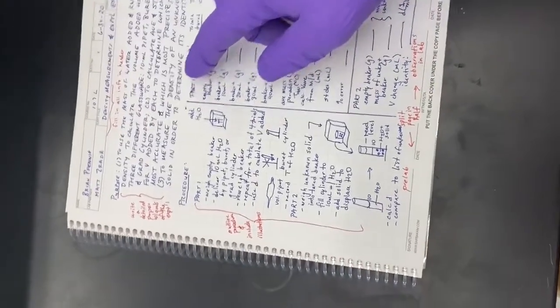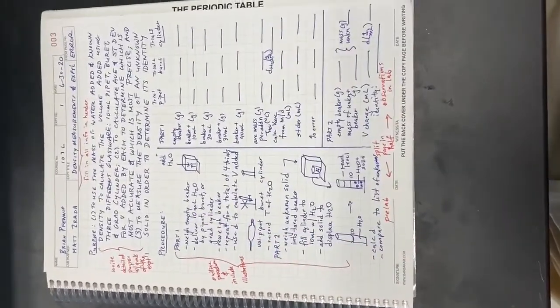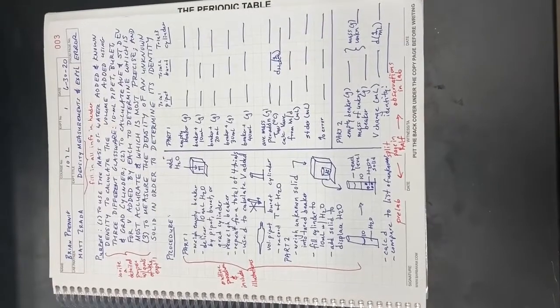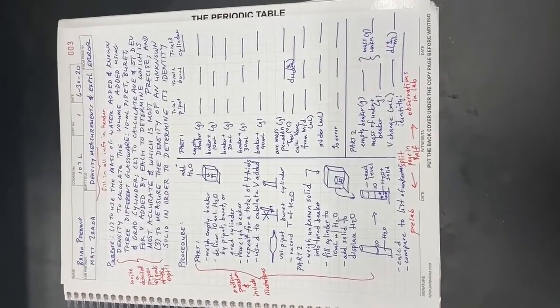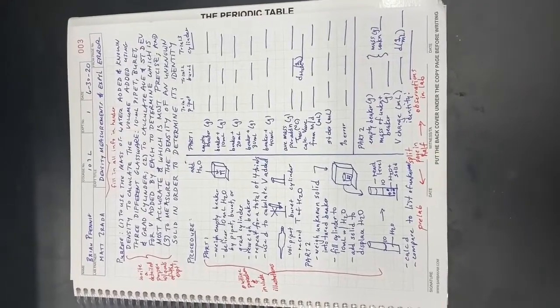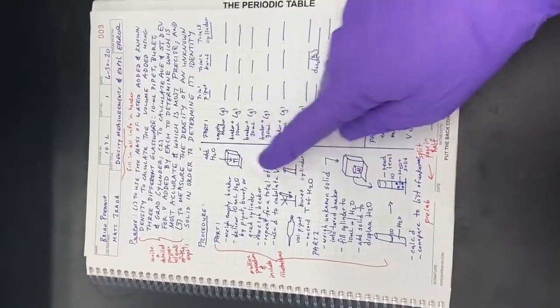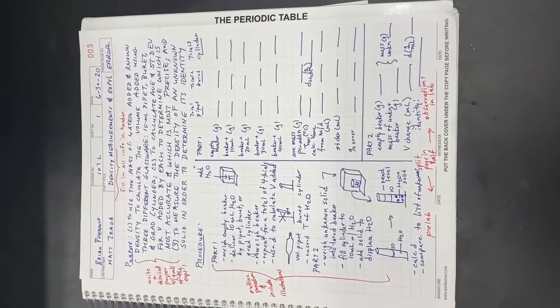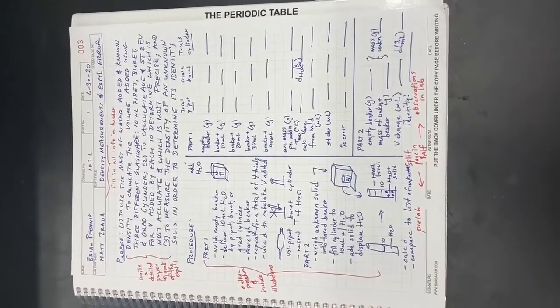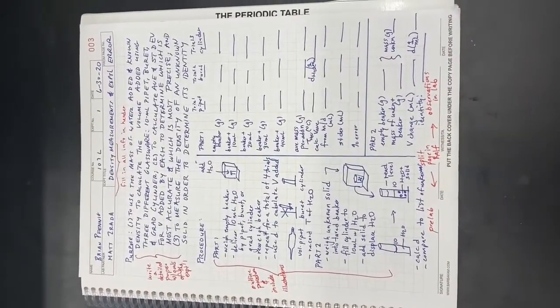Next, you'll want to divide your lab notebook into a half with a vertical line. On the left side of this line, you're going to write the procedure. You don't have to write out the procedure word for word. You can make a detailed outline of the procedure, and when you're making your outline, we encourage you, in fact, we expect you to make drawings that are showing what the different steps are that are going on. This helps us to know that you understand the procedure. The procedure only needs to be written in enough detail so that you could do the lab based on what you've written in your lab notebook.